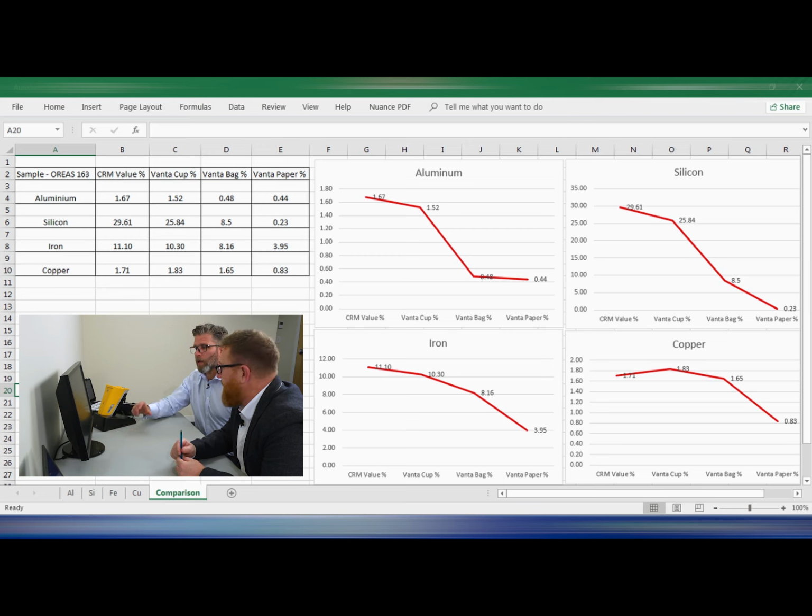So I know some of our customers are taking the chemistry of the bags and subtracting it from their final data sets. Yeah, and the way to do that is to just put a blank underneath whatever film, plastic, paper you're using to understand what chemistry is in the container. That sounds like good practice, Todd.